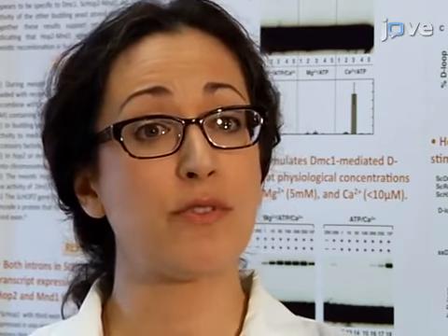This method can help answer key questions in the study of subnuclear structures, such as, do two proteins co-localize? Or does the formation of a particular nuclear substructure depend on the function of a given gene of interest?